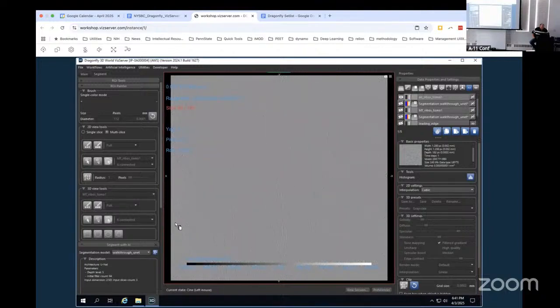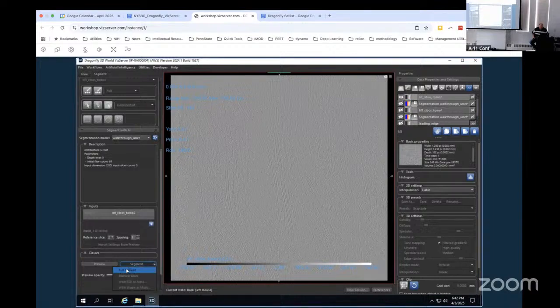So open that tomo and go to slice 75, maybe. Somewhere near that, so you can see what this tomogram looks like. And this is more intracellular stuff, microtubules, but more actin and cofilactin as well. So let's just select it and infer our network to it.